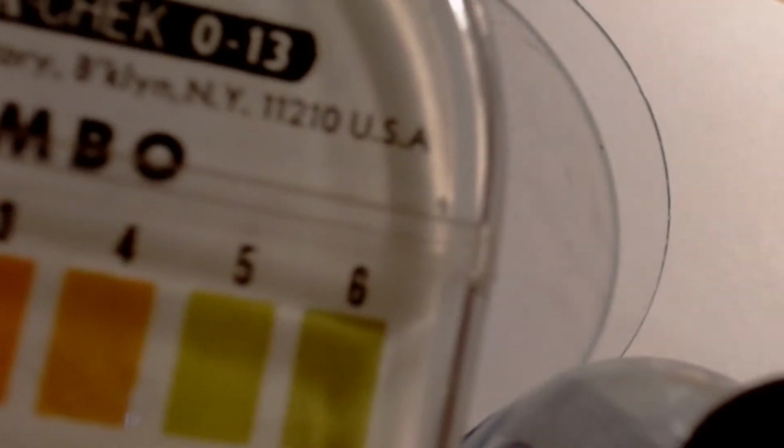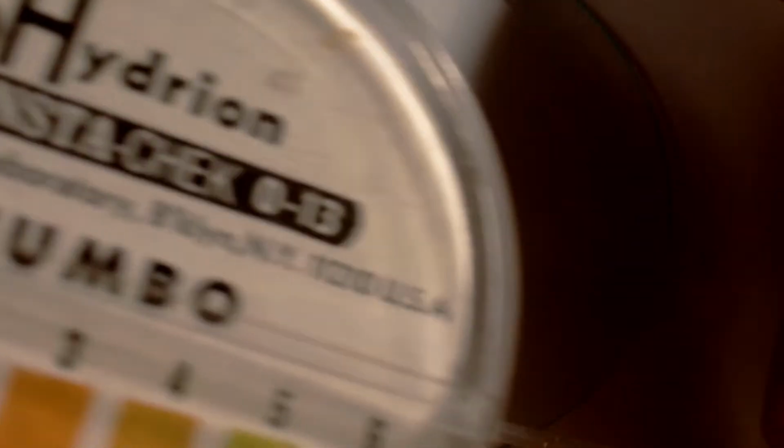So what I have is some pH paper. And pH paper looks like this right here. It has a scale on it, so you can tell the pH of what we're working with. This is a Hydrion pH paper, and I'll just tear a piece of it off, put it right there. Let's get some more light on that. And we're going to put some lemon juice on it.